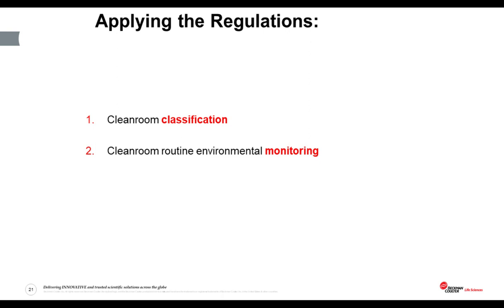So typically, no two routine environmental monitoring programs are the same between different sites. Now, the challenge here is that the absence of any specific guidance for routine monitoring frequently leads cleanroom users, from what I've seen in my experience, to default to using the same points for monitoring as they used for classification. However, I can categorically say this is wrong.